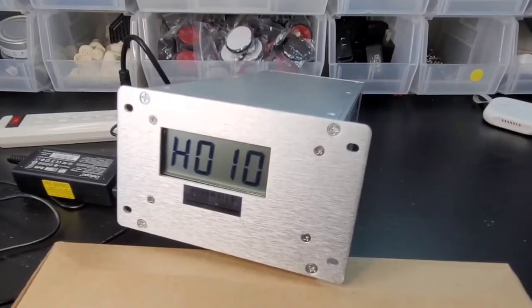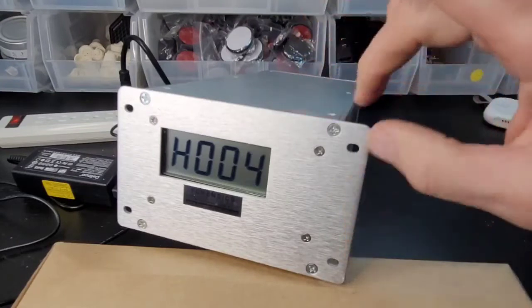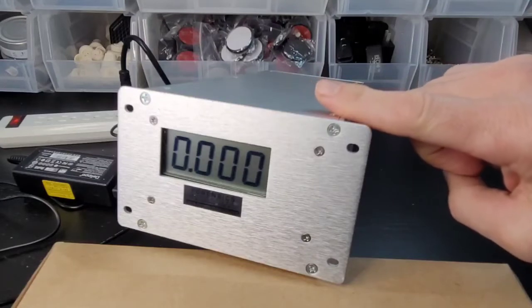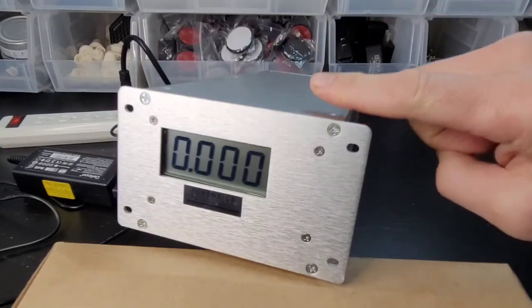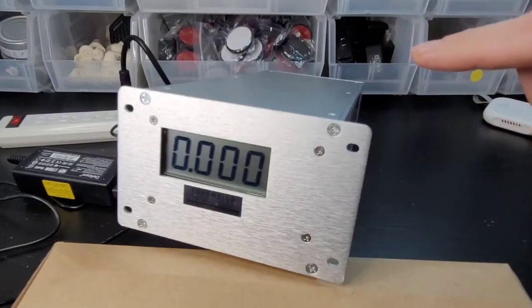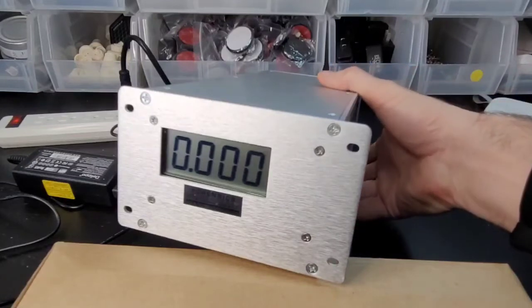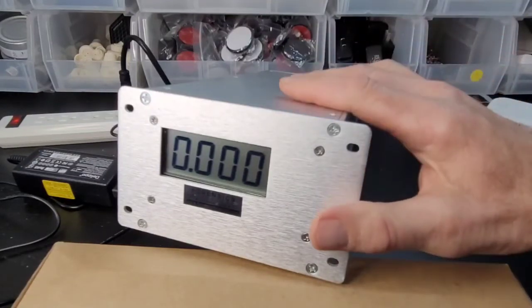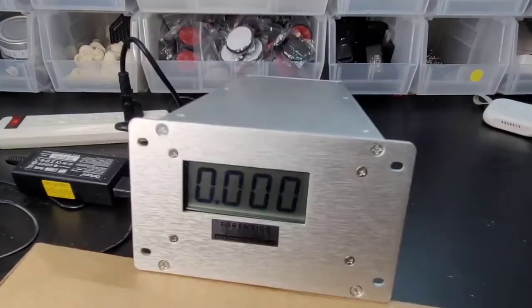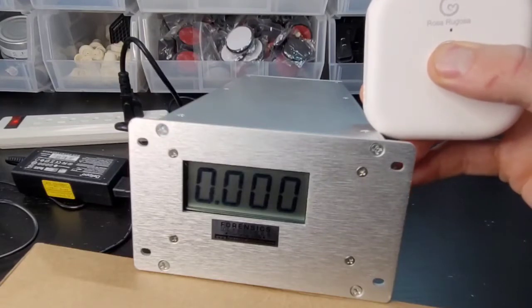Okay, folks, we're back to the last 10-second countdown of the analyzer coming to start up. So I wanted to take this so you could hear what happens. So you hear the pump working and you get your 0.00. Okay, now you also hear the solenoid clicking over from sampling to then averaging. Okay, so that is very normal, what you are hearing and experiencing, and that is how it should be for you.